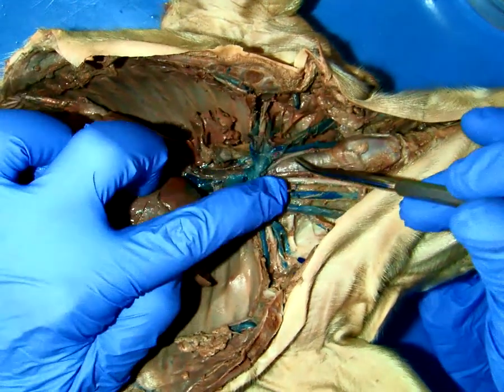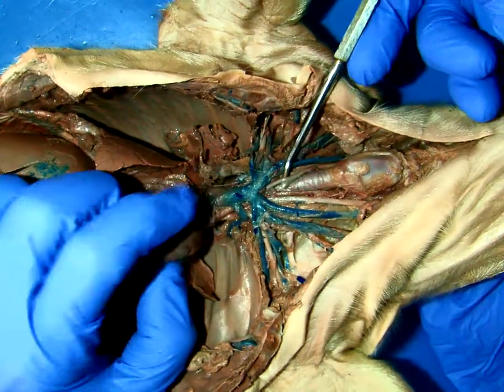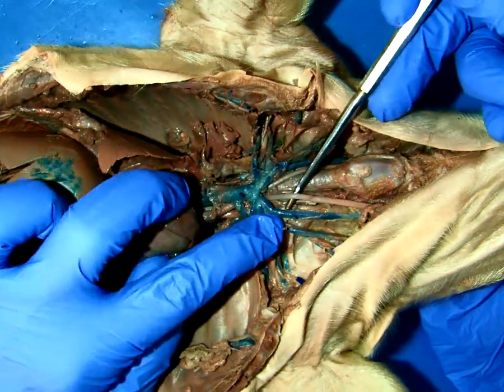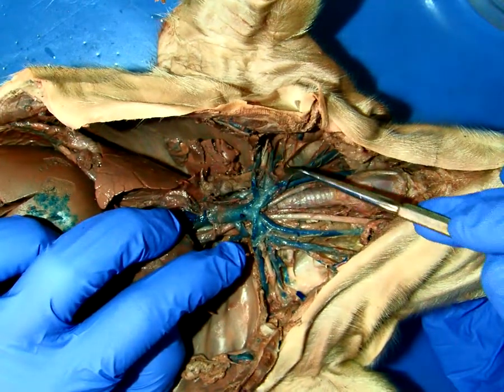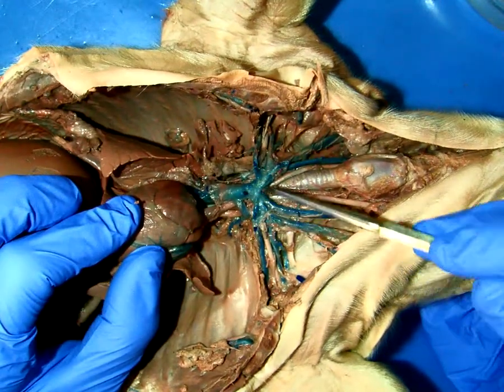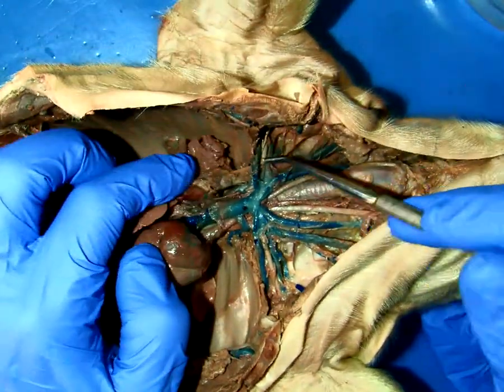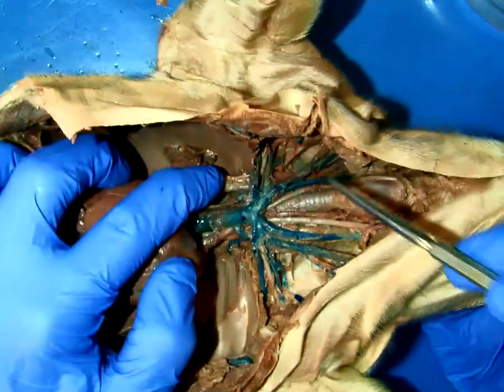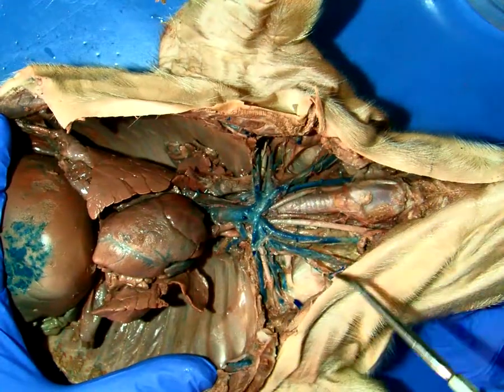And of course there's the right common carotid, which is going to run right next to the trachea, that branched off of that. And here's the left common carotid that came from that as well. So we have the 1, 2, 3 branches from this brachiocephalic. And this would have happened right under here. I didn't ask students to know any more than that; they didn't need to go into the limbs. So if we look at the venous side, again focusing just on the thoracic cavity.